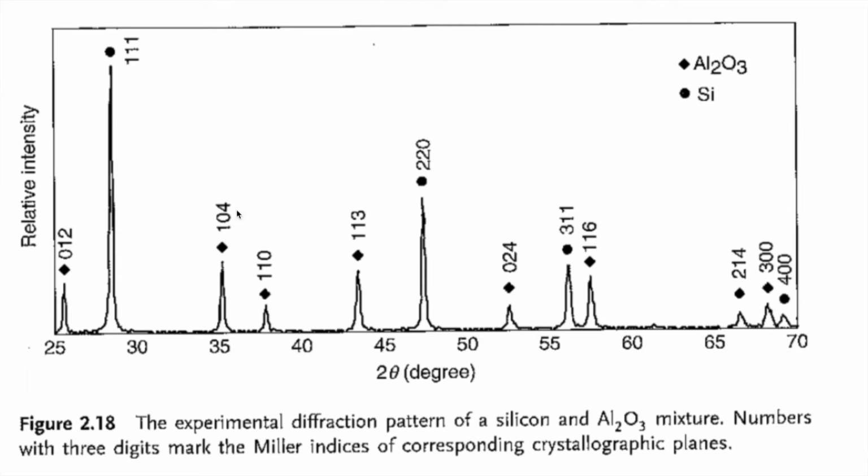So what we need to know to get some of this information on our own is where the peak is located, so the 2 theta value, so the peak center, and we also want to know the peak intensity. And so that's, again, always the relative intensity. So we typically call this one, which is the highest peak, the 100% peak. And everything is referenced off of that peak.